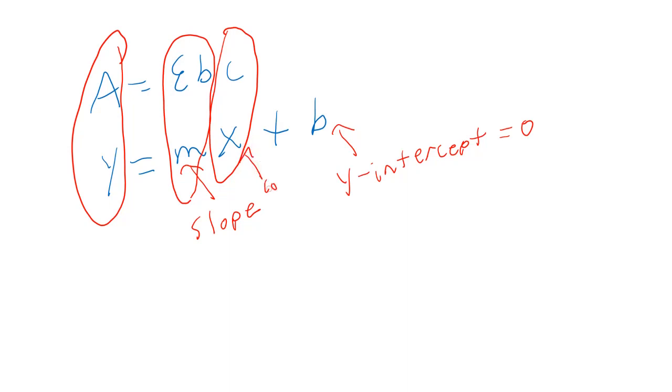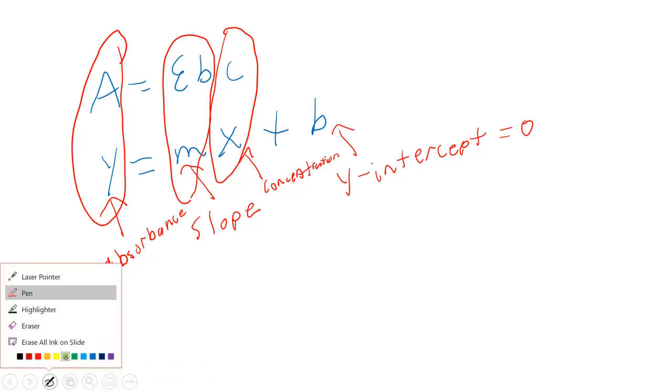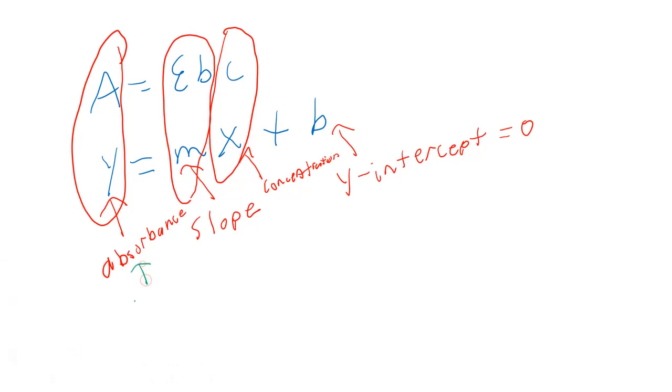and then you're going to determine the concentration of your unknown, and x is the concentration, and you're going to do that by measuring the absorbance. So you will get, let me get another color here, one a little bit darker just so we can read it. The absorbance is going to come from your LabQuest, which you're going to measure. And your LabQuest will also give you the values for the slope and the y-intercept. So what you're going to do is calculate the concentration.